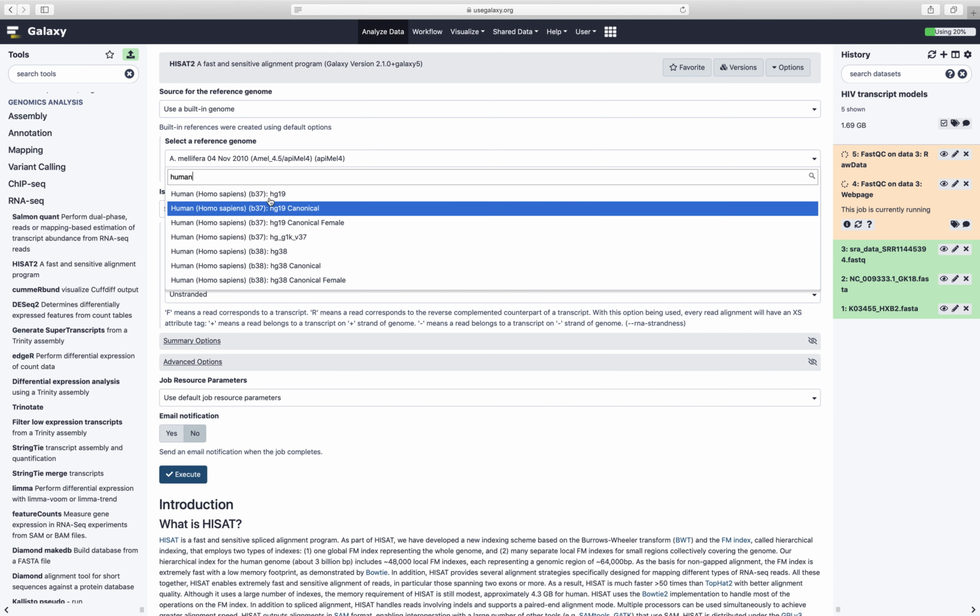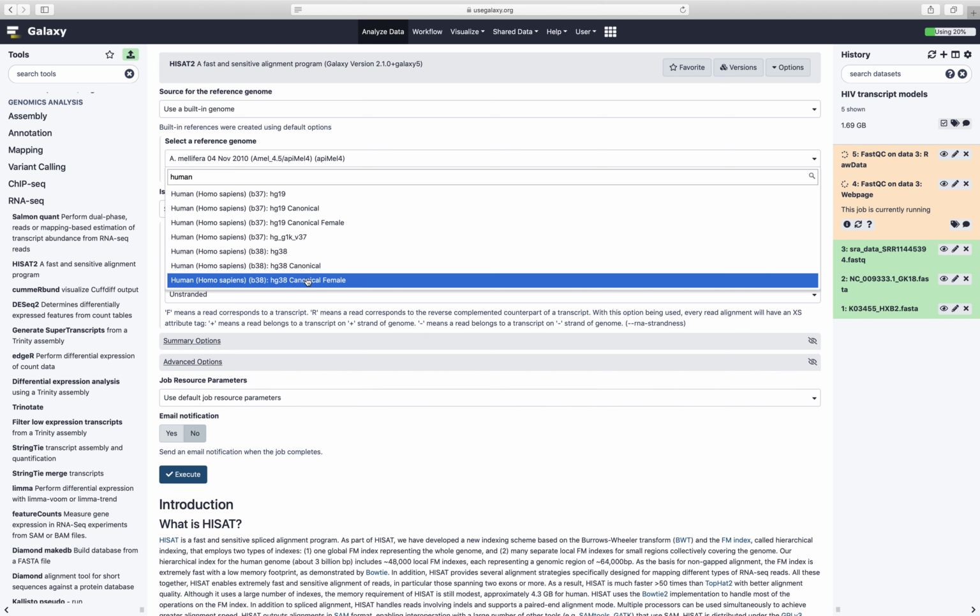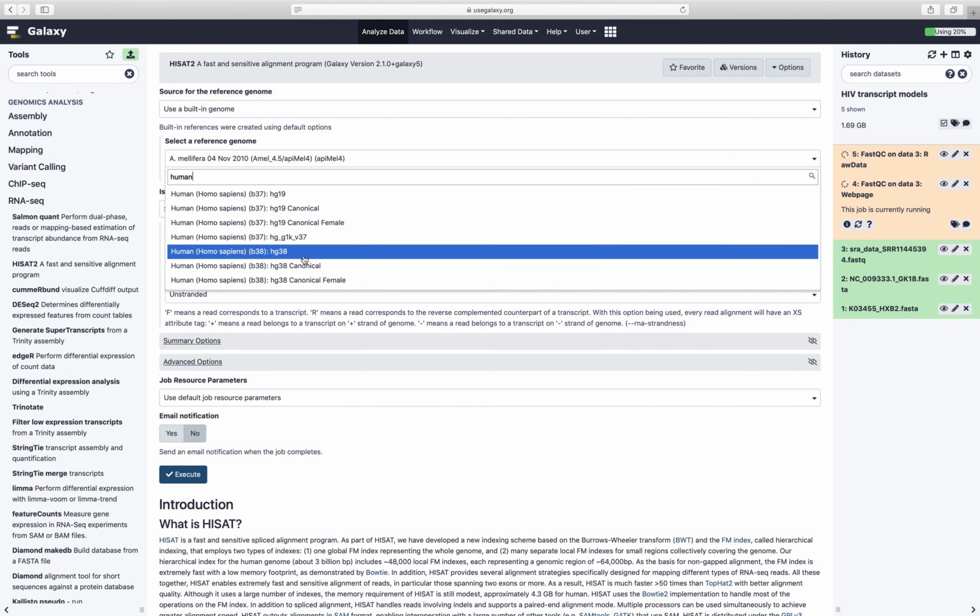Then this gives us an older version and a newer version. So HG19 actually has a lot of gene regulation components, but it's less complete. HG38 has more completeness, but then there aren't as many epigenetic tracks associated with it. So ideally, you could actually just try all of these, and that's one of the nice things about bioinformatics, that you can just try a bunch of things and actually look to see whether or not those results make sense.